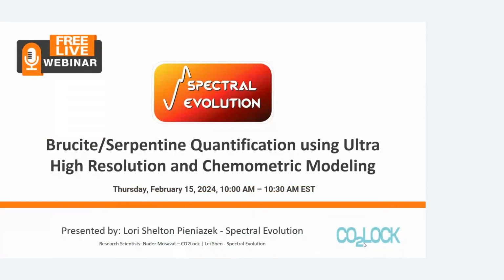All right, so we'll go ahead and get started today. Welcome to the Brucite Serpentine webinar. We're going to be talking about how to quantify brucite and serpentine minerals using ultra-high UV, vis, and IR spectroscopy for the carbon mineralization application.